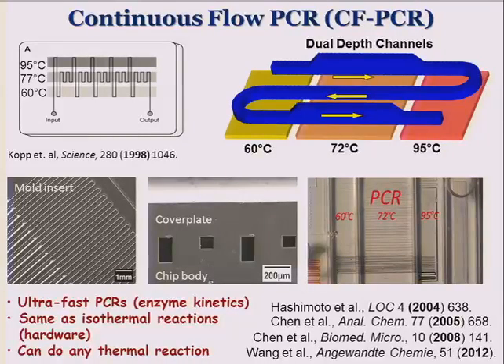That just shows you one of the nice attributes of molding. You can make multi-level structures. You can make structures on the front and back side of the substrate. You can make slanted structures. You can do a variety of different things with the molding. The reason we do that is that this is the bottleneck right here. I don't care what enzymatic reaction you're doing, the bottleneck is how fast the enzyme works. It's kinetics. So what we do, without increasing the footprint too dramatically, is increase the cross-sectional area of this channel.